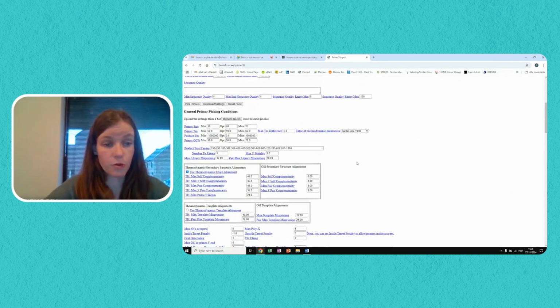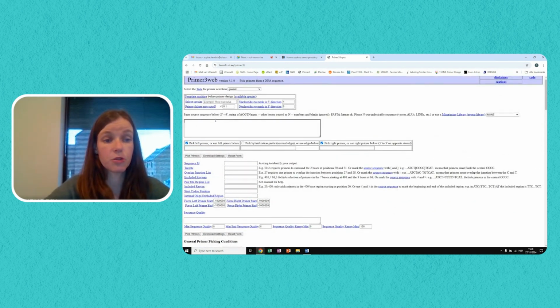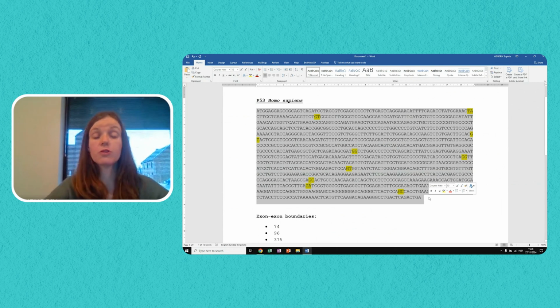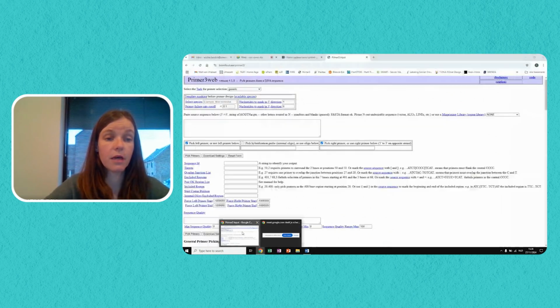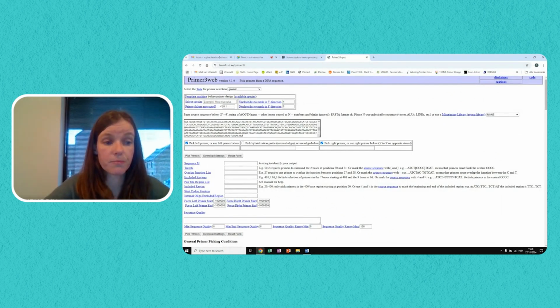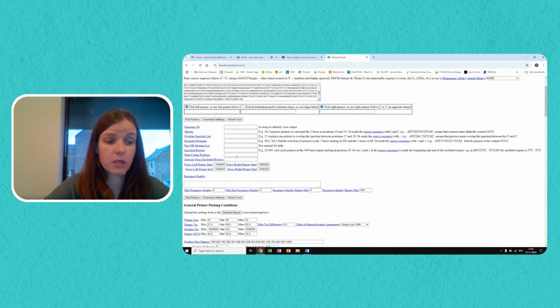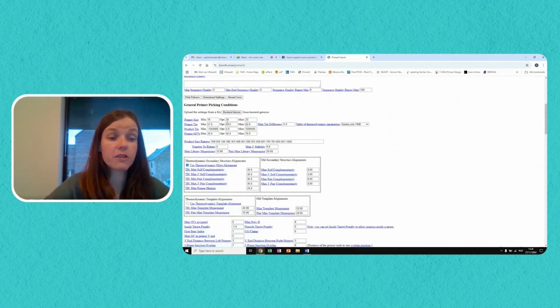And what you will do then is you will paste here the source sequence. And the source sequence is the entire coding sequence, because we want to design primers anywhere in this coding sequence. So we copy the sequence and paste it into this box. Subsequently, most of these boxes we can leave empty. However, here there are some boxes which we will fill in.